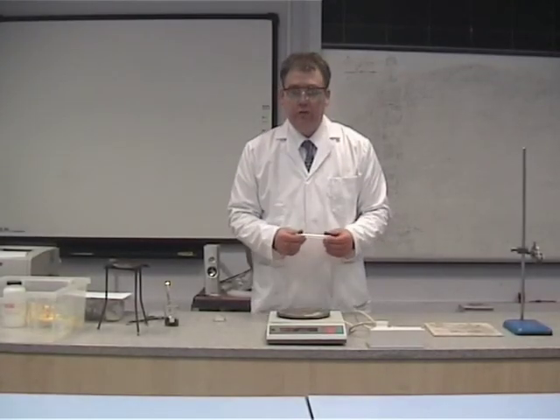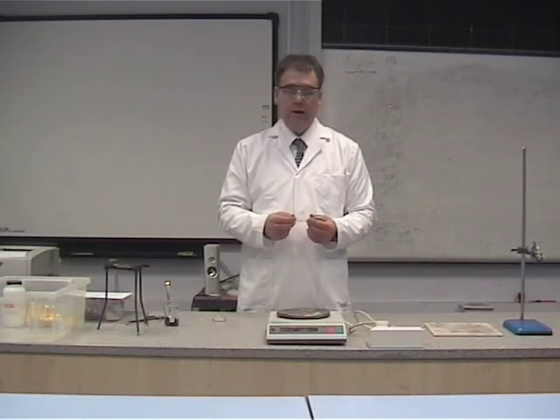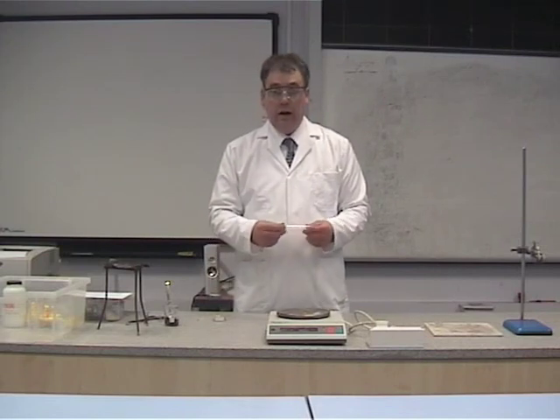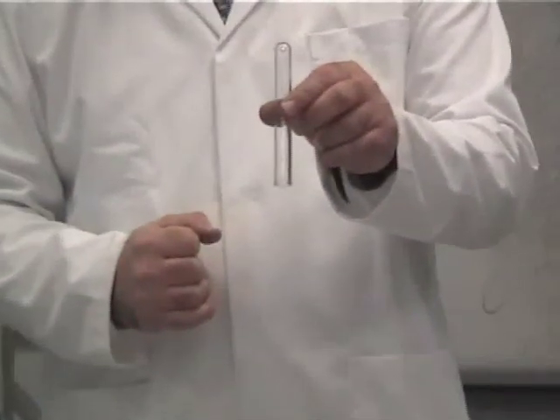Hello, this is the demonstration of the copper oxide experiment, where you find the empirical formula of copper oxide by carrying out a reduction with methane gas. You need to use one of these special test tubes. It's got a little hole in the top there which the gas can be allowed to escape from.